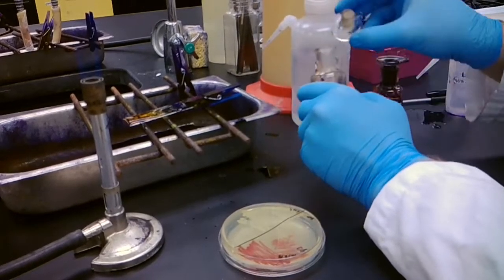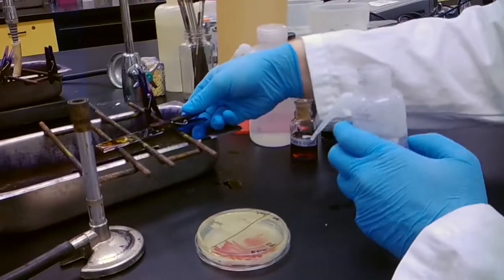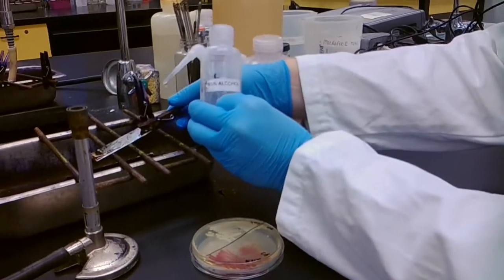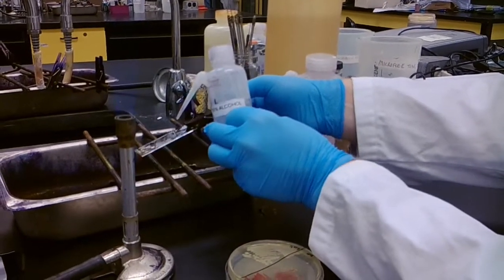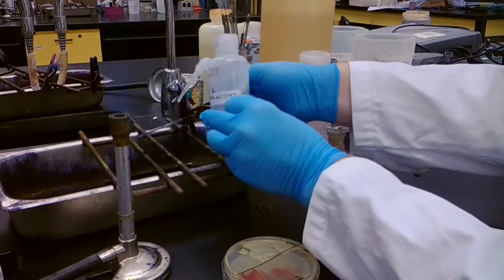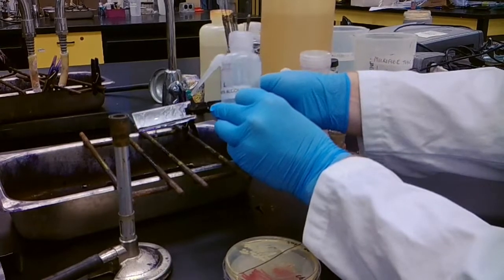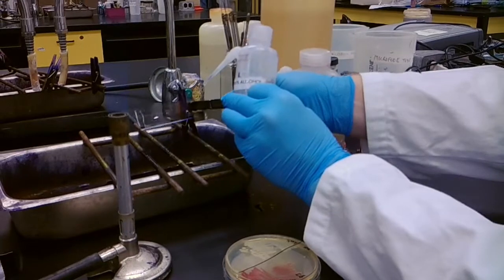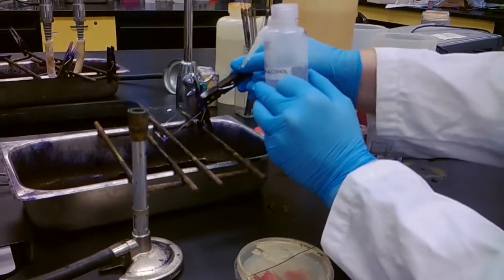And we're going to let this sit for about 30 to 60 seconds. Now that it's been 30 to 60 seconds, we'll take 95% or 70% ethanol and rinse all the iodine off until we don't see any purple on the slide. As you can tell, there's no crystal violet on the top surface of our slide.